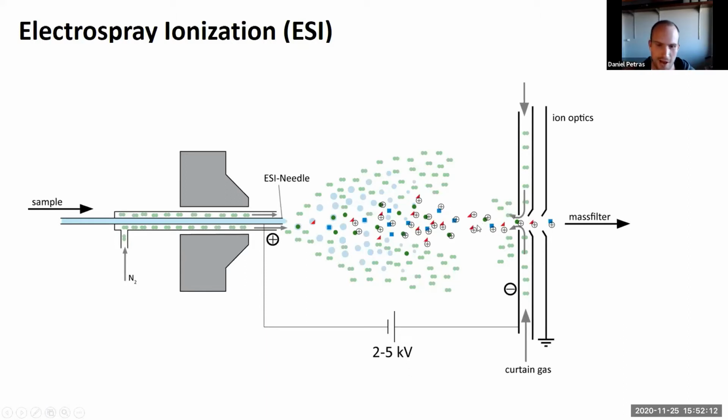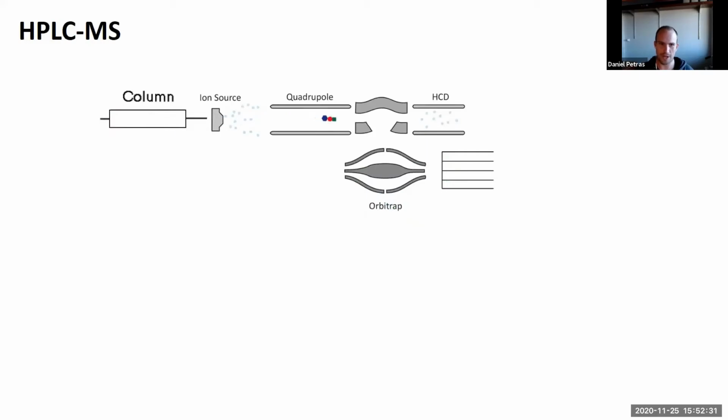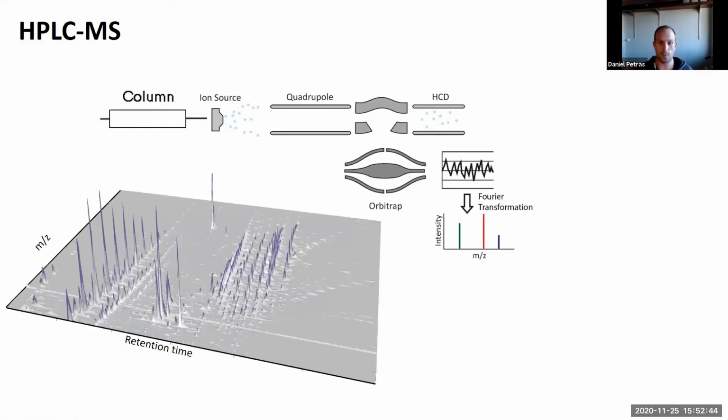There's some interesting basic research on that, but roughly that is how it works. And I think this is really exciting because that is typically the ionization technique that is used to couple mass spectrometry and liquid chromatography. That is of course really helpful because now you can first decomplex molecules on a column and then get a readout and measure the mass. Besides your chromatogram, you would have an additional dimension where you can directly see the mass. If you've used this already, you know that comes in really handy when you try to characterize unknown molecules from your extract or whatsoever.